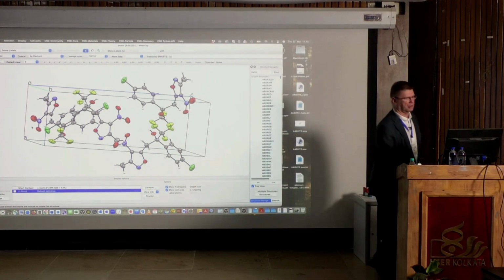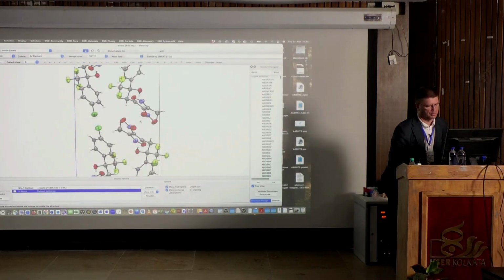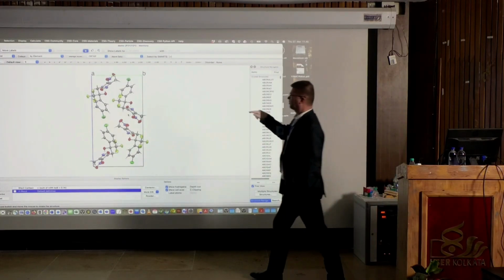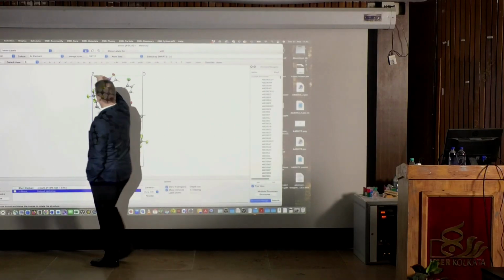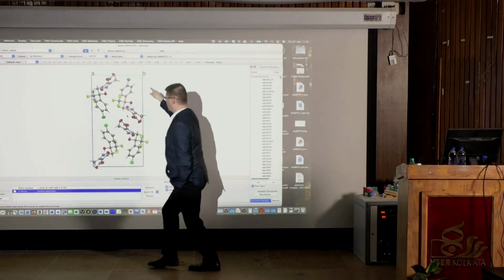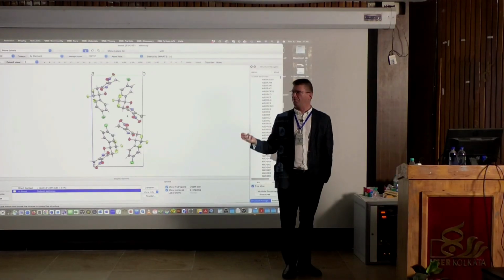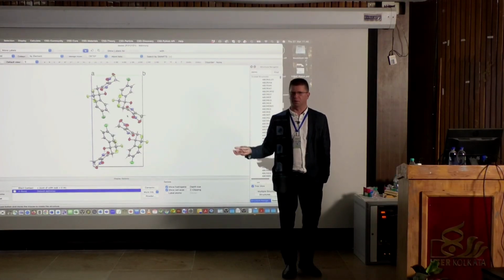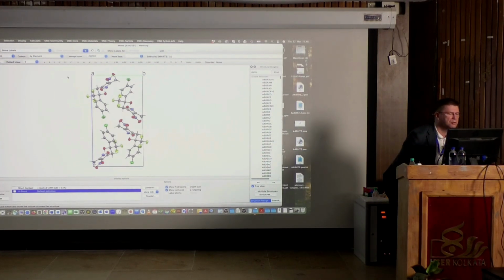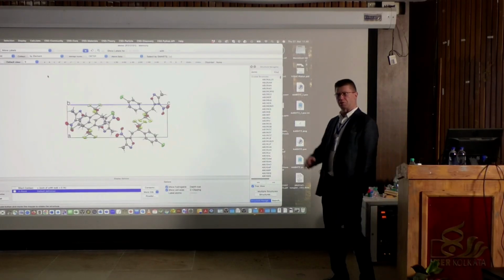So when you do this, you have to be careful. But in here there's a knob that says A. Now the view is along A axis. So here is the origin and A, so we are looking from this direction. When we are looking along A, we have a BC plane in this thing. So that would be the view of packing along A axis. And then if you ask, what is the same thing along the B axis, you just go here and click this one, and that is the view along B axis. So the packing is different.